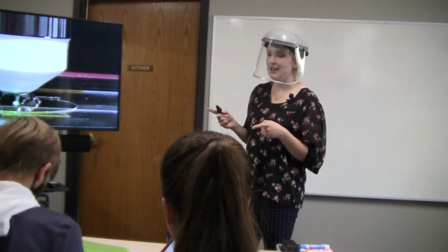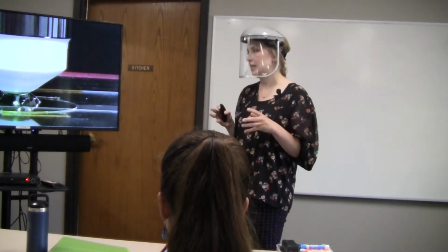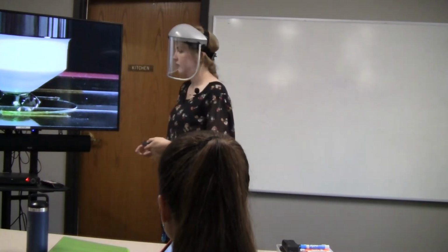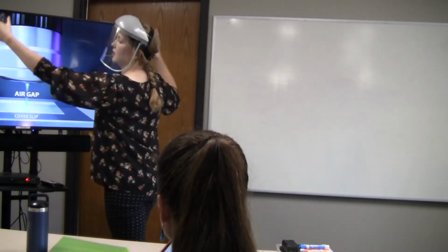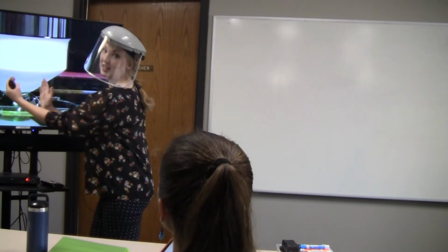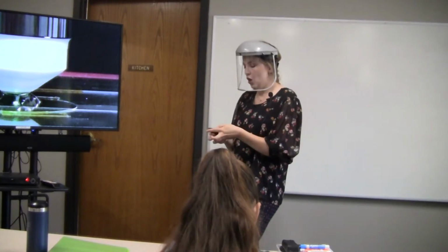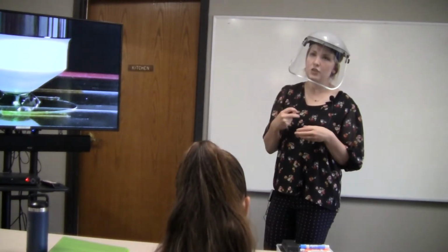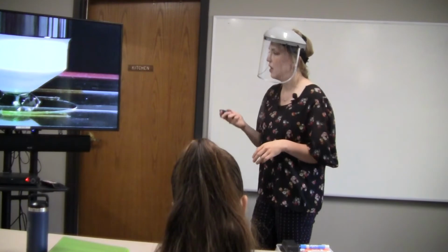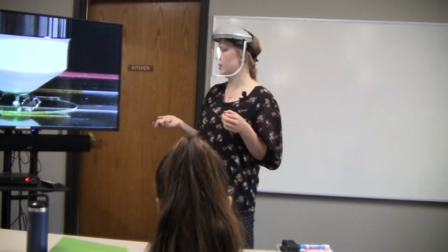What the oil does when looking at really, really small things, so we're talking about bacteria cells, which are tiny, is it keeps the light from scattering. Here, see the big way the light fans out? What the oil does is it focuses the light on the lens and keeps it from scattering so that you're actually able to see the bacteria. Otherwise, with a normal light microscope, you can see bacteria, but not very well. We'll look at some bacteria slides here in a couple weeks. But you have to have colonies in order to see them. You can't see individual bacteria very well.